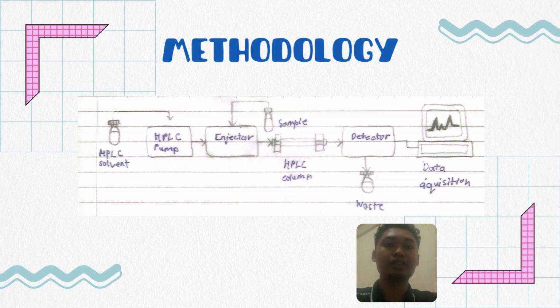Filter the sample solution using a 0.2 micrometer membrane filter to remove particulates. Transfer 10 microliter of the prepared sample into an HPLC vial. Place the vial in the auto-sampler or injector tray. Use the injector to introduce the sample into the mobile phase stream. Ensure the injection volume is consistent to maintain reproducibility. We use 10 microliter volume in this case.